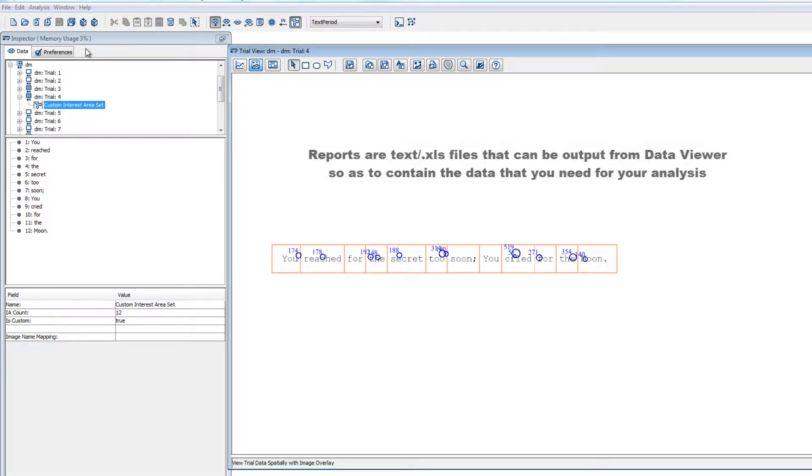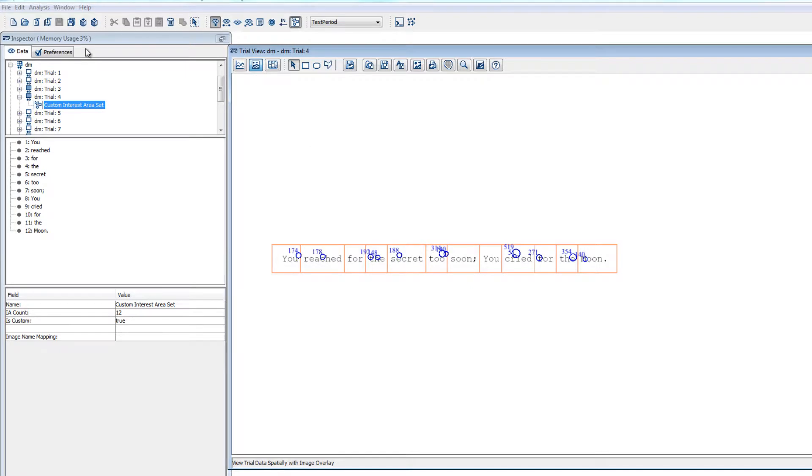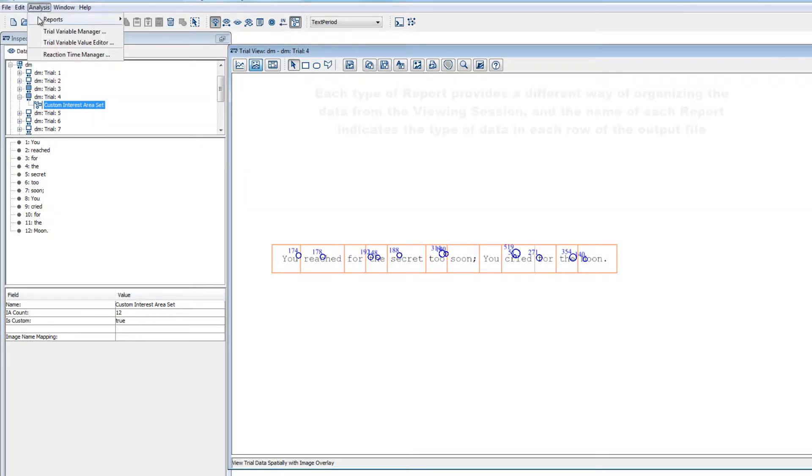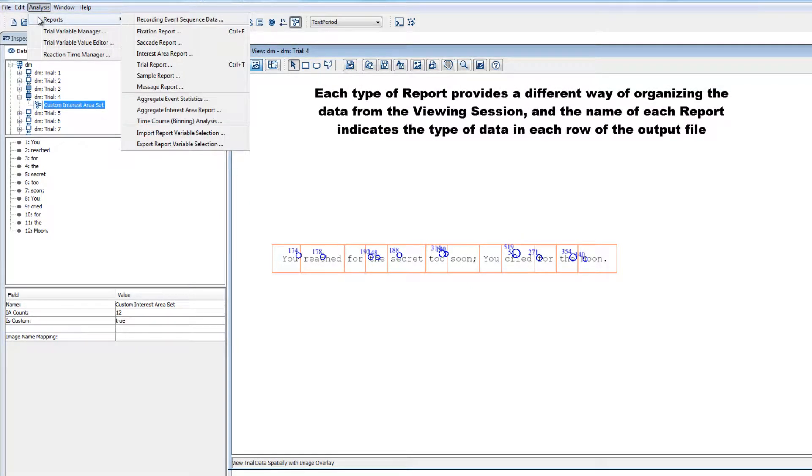Reports are output text files that will contain the relevant data for your analysis, and they can be created by going to the Analysis Reports menu. Each type of report provides a different way of organizing the data from your viewing session, and the name of each report indicates what the contents of each row of the output file will be.